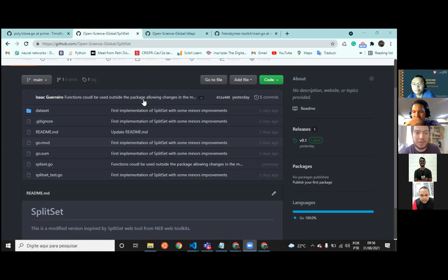So if you have one machine, I think ideally you want one human with the machine to see if everything's working and to change something if necessary. And so 1,000 ligations, seeing that one ligation is one sample, this will take some time to automate, or you need a lot of machines and people to work on these machines also. So it's not as high throughput as they made us think, right?